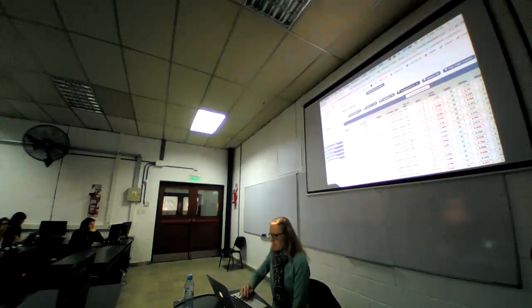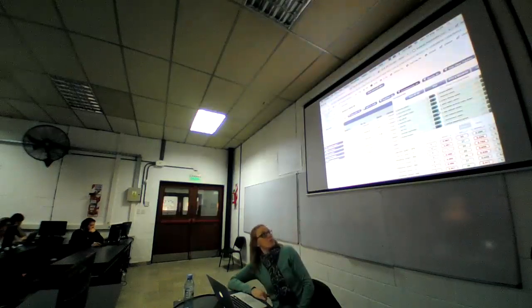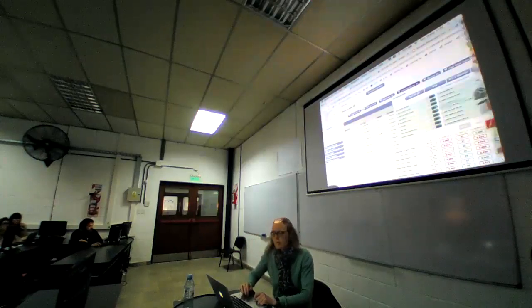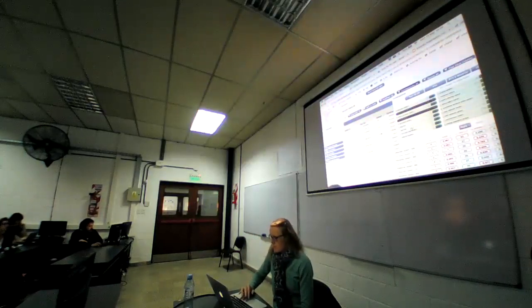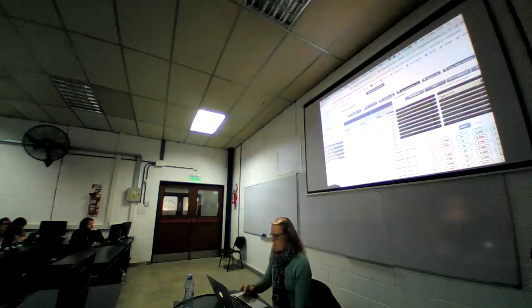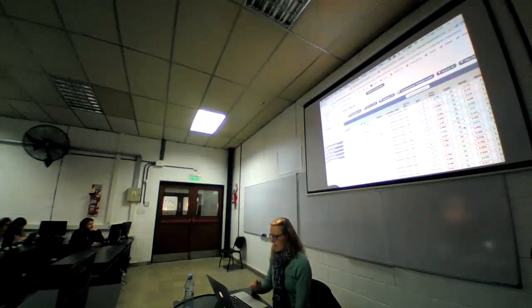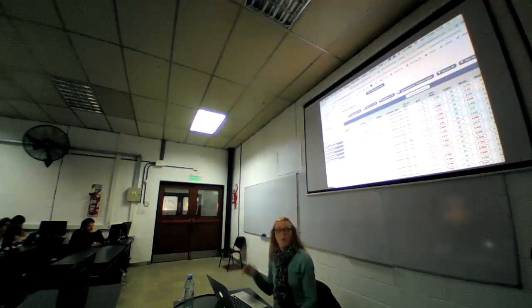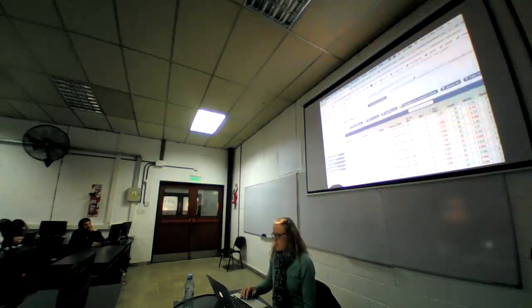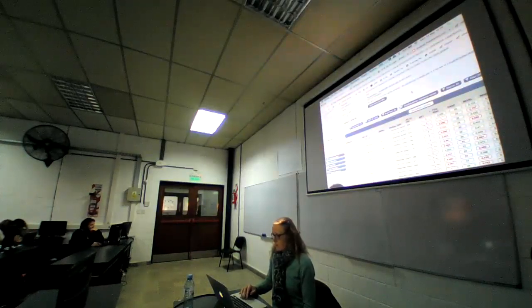You can also filter for consequence types. These are all the options that you have. It's cut off on the screen a little bit. There are more on the right-hand side. So you can deselect some, or you could switch everything off and then just switch some of them on, say missense variants, and click apply. And now I've opted for combining two filters. And you can see that you have applied a filter by these green X's here. If you want to remove that again, you click on the X.